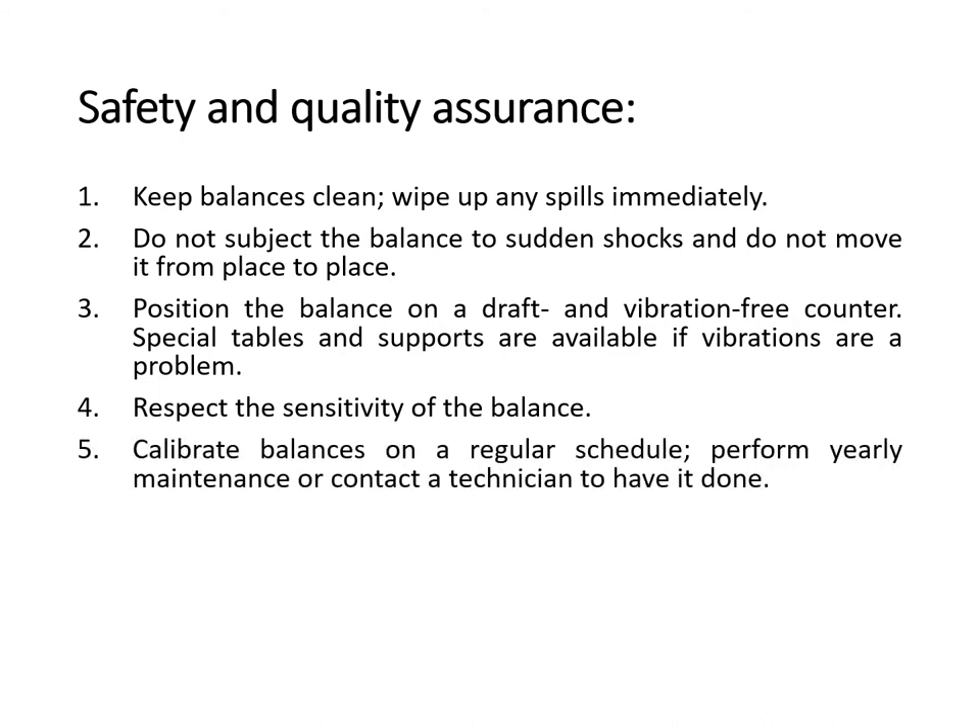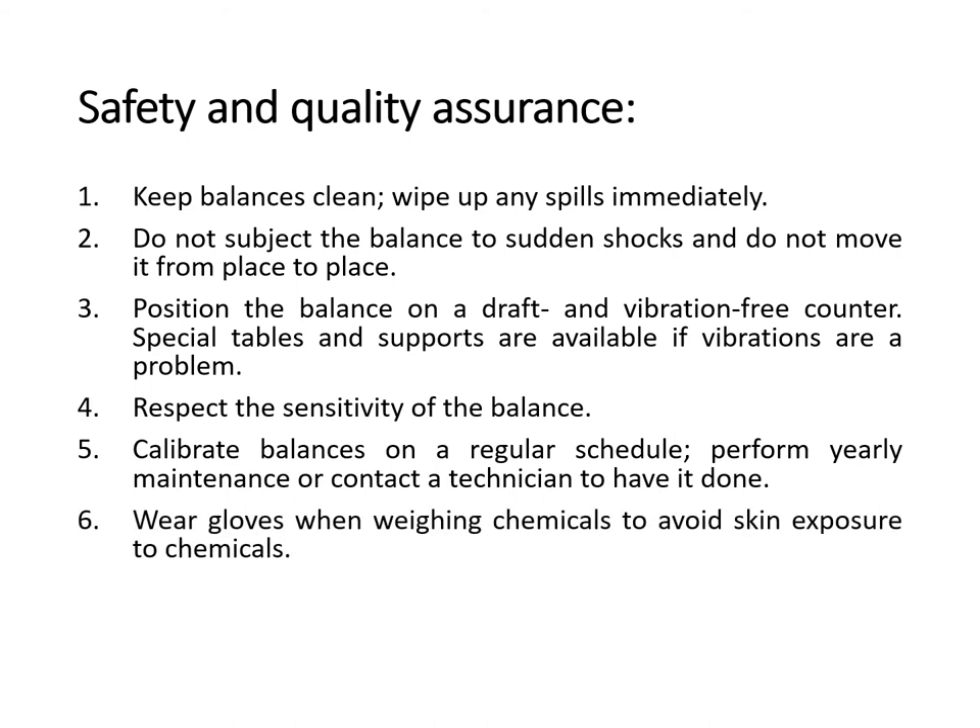Fifth, calibrate balances on a regular schedule and perform yearly maintenance or contact a technician to have it done. There are people assigned to perform calibrations of certain equipment, and sometimes it is not the job of the medical technologist to perform calibrations unless trained to do so. If you need a machine calibrated, you have to call someone from the company where you purchased the machine. Sixth, wear gloves when weighing chemicals to avoid skin exposure.